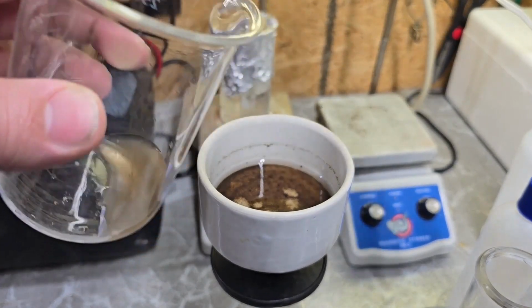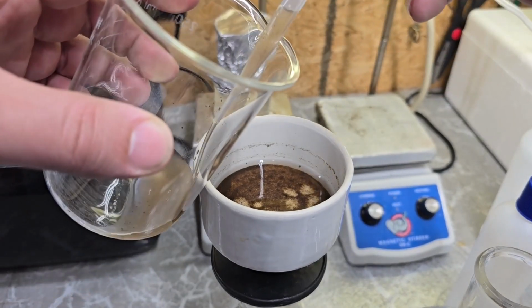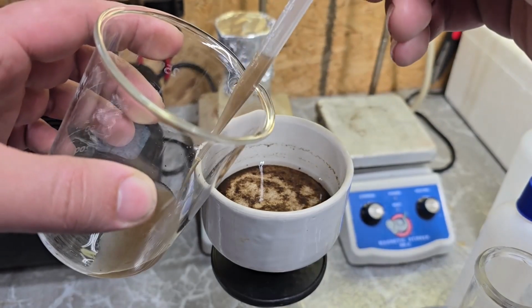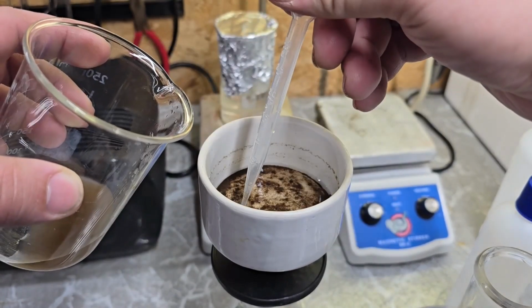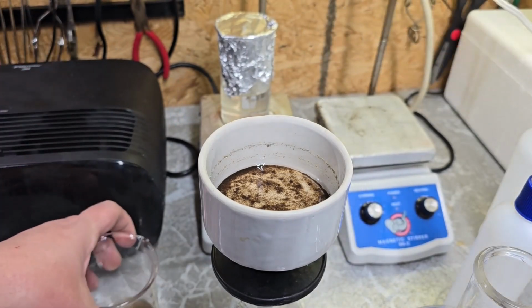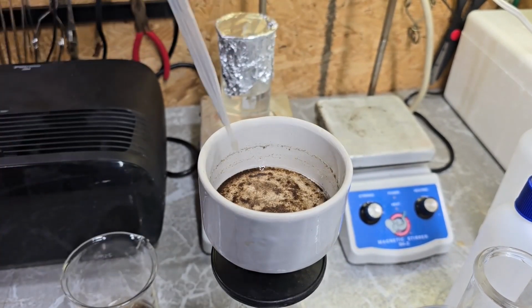Got a nice concentration of little stuff on here. Hopefully we got a good collection of little critters that we can observe under the microscope. Whatever's in here, man, it's got to be so confused right now. So I'm just going to let that vacuum pump suck that little tiny bit of water left through here, and then I can peel this filter paper off. Nice little collection of stuff right there, actually.